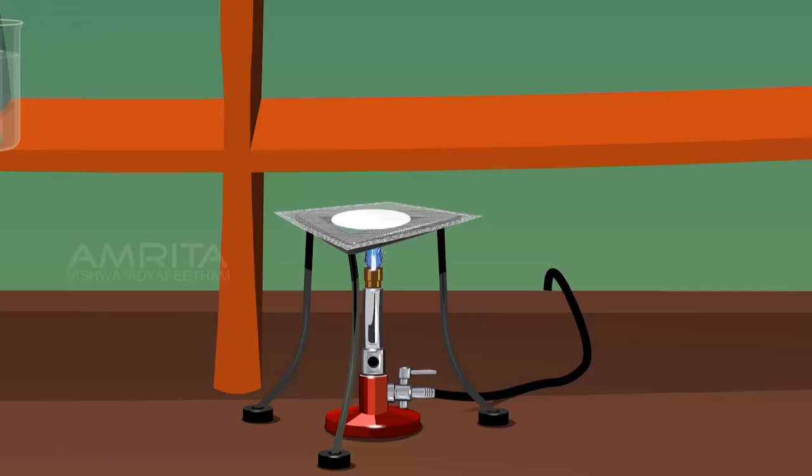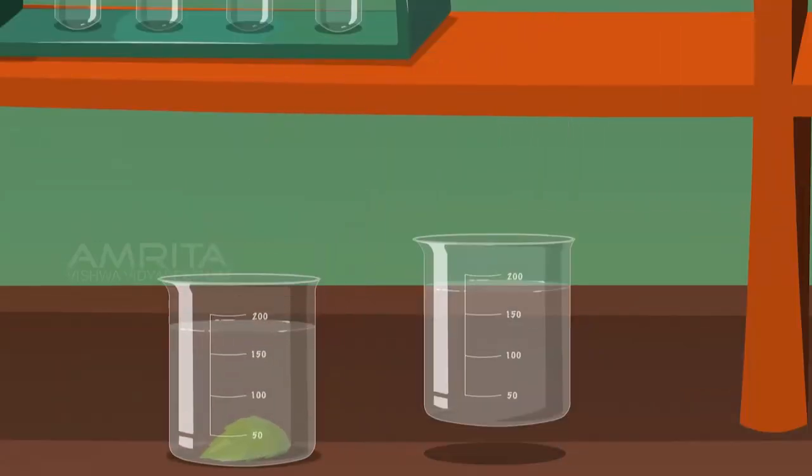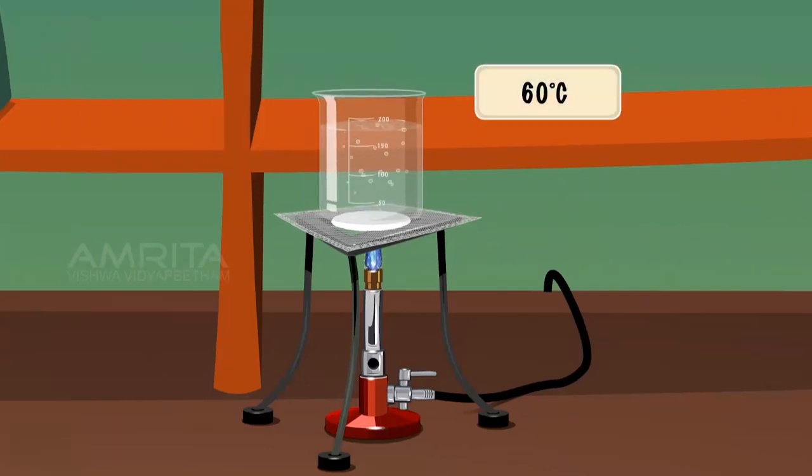Remove the beaker from the tripod stand and allow it to cool for some time. Take another beaker containing distilled water and place it over a Bunsen burner and boil it to about 60 degrees.